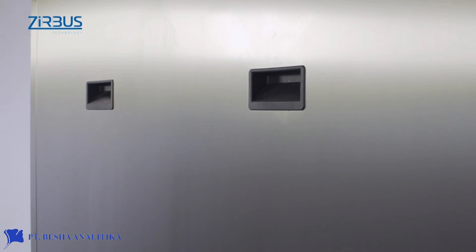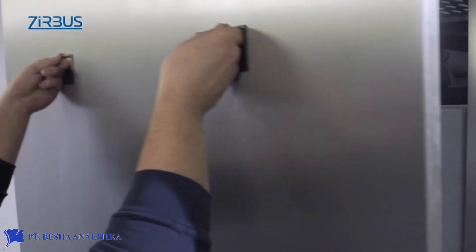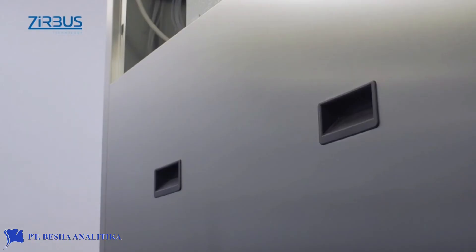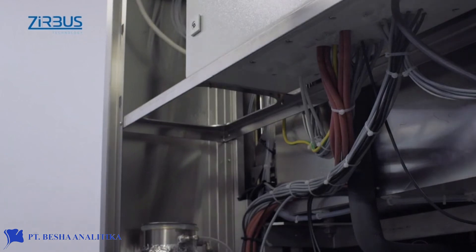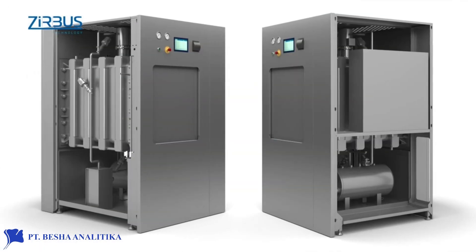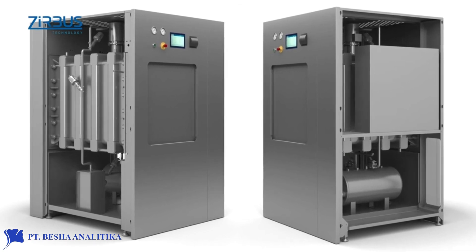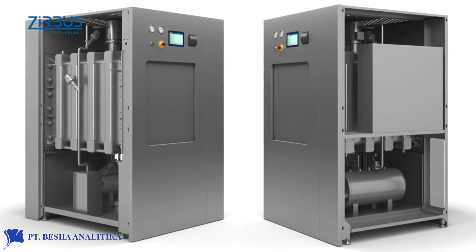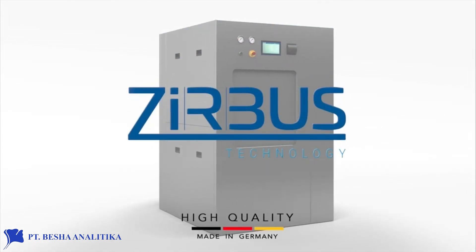The sterilizer was developed with an eye to more than just function. Considerable attention was also paid to cost-effective maintenance and cleaning. Maintenance is quick, thanks to its easy to remove metal housing. The recessed handles in the housing make the unit easy to disassemble, while rounded corners and edges make the inside of the autoclave easier to clean. ZIRBUS technology — we're there for you.